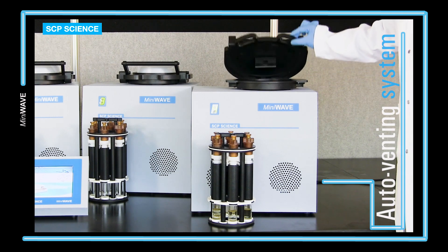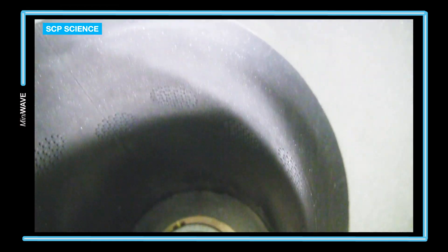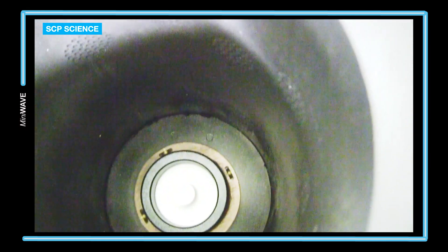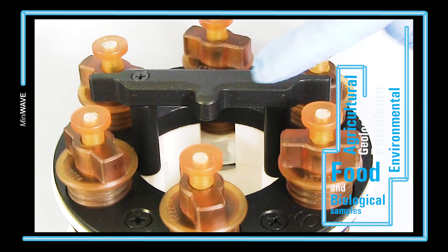An IR sensor monitors the sample temperature in each vessel. A 1000-watt magnetron is positioned axisymmetrically. With this unique design, microwave energy is evenly distributed for reproducible results.